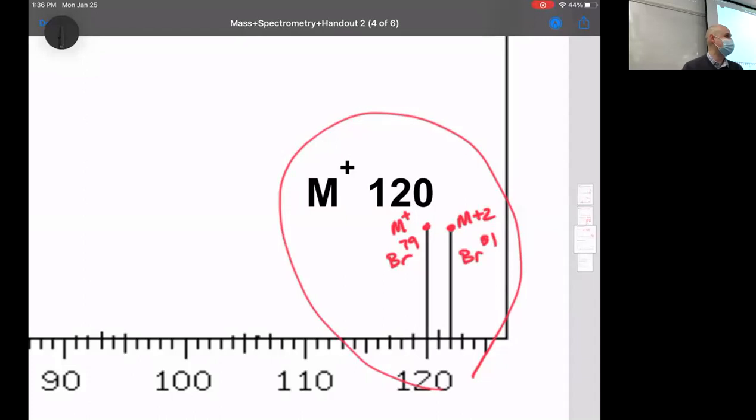41. It's also 41. So no matter which way you go, this molecule is 41 of something plus bromine. And if that bromine was 79, you'd get 120, which you'll get half of the time. And the other half of the time, the bromine would weigh 81. Your 41 plus 81 would give you 122. And that's why you see those peaks. Does that sound unfair? All right.